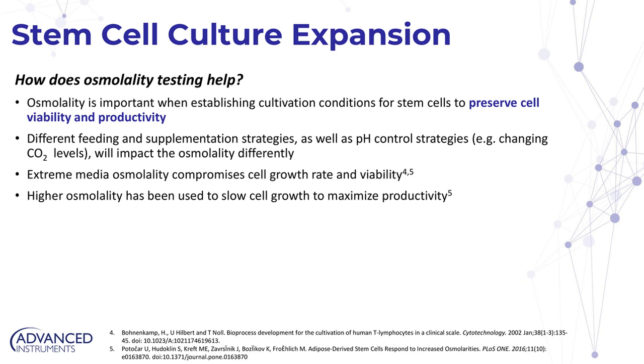But because the cells do require a physiologically relevant environment, there's this dynamic interaction as they're absorbing nutrients and producing waste. It's something that's going to be changing. The osmolality will be changing over time. So it's something that should be monitored for sure.